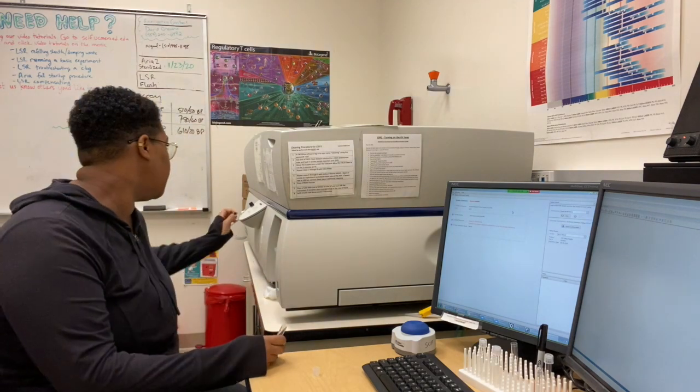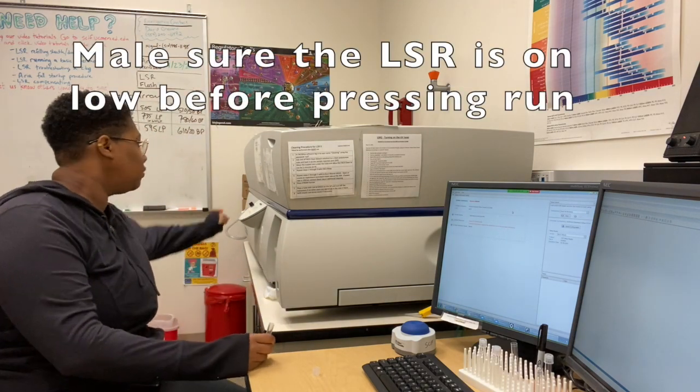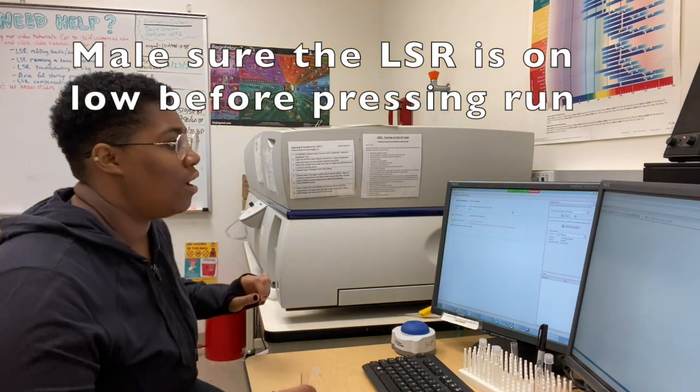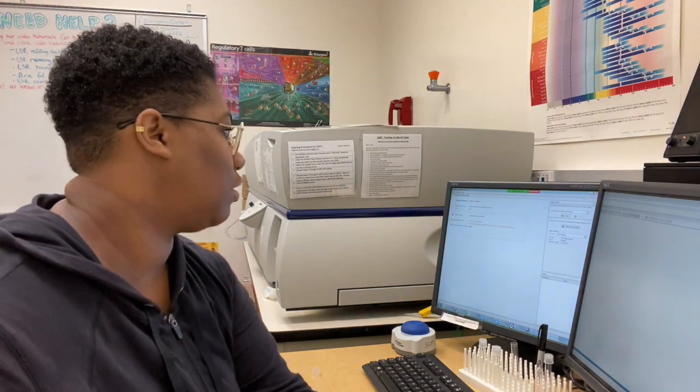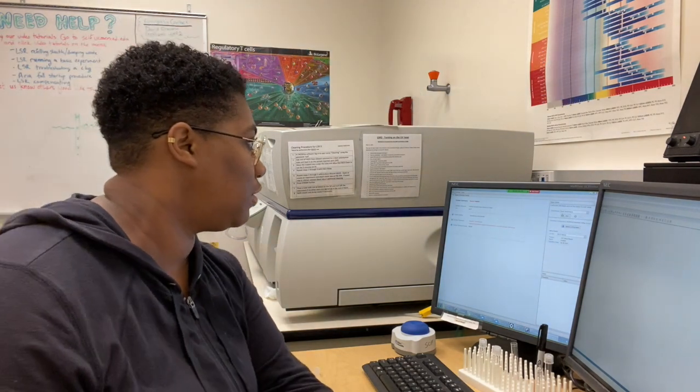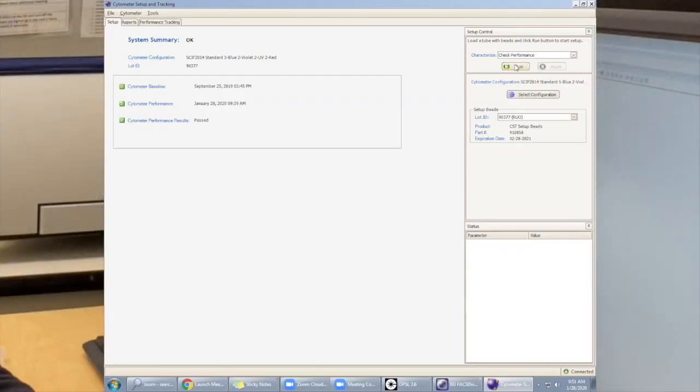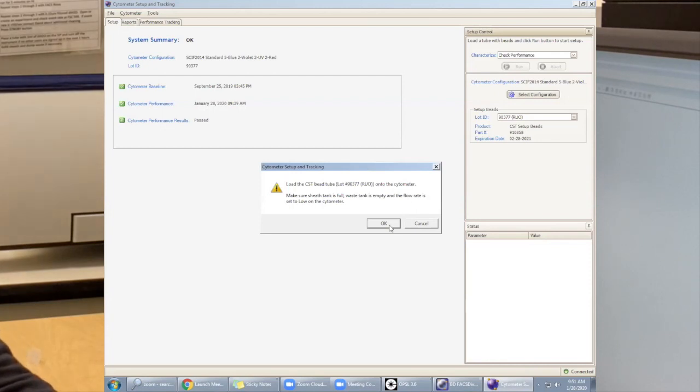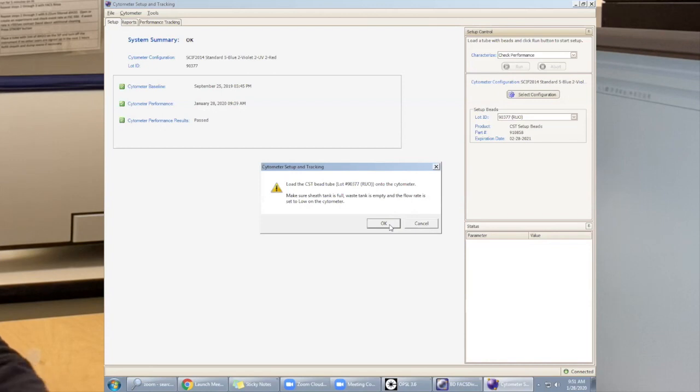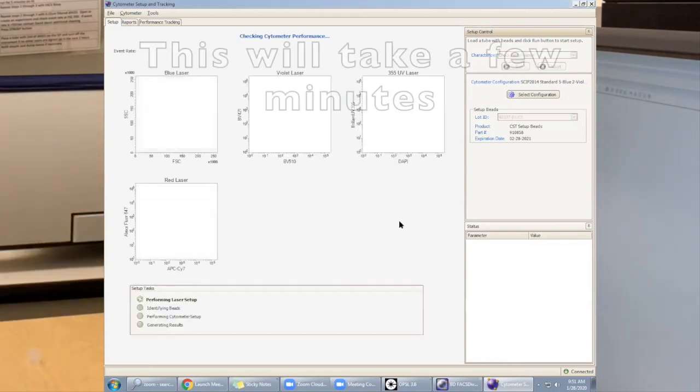For the LSR, you want to press run. Then go over into the CST application and press run. It's going to make sure that you have the correct bead lot, and you want to press OK. Then CST will run.